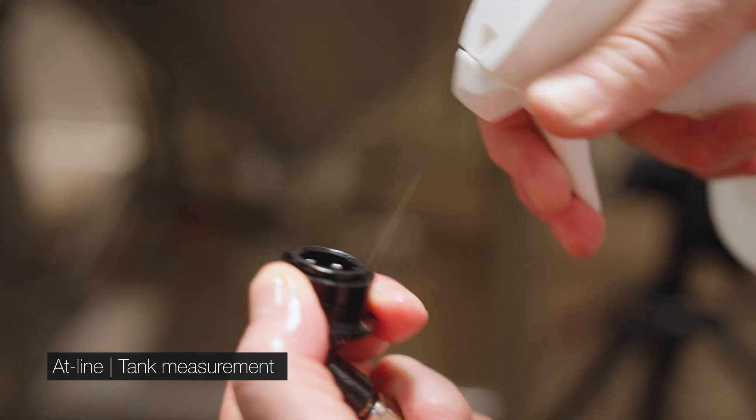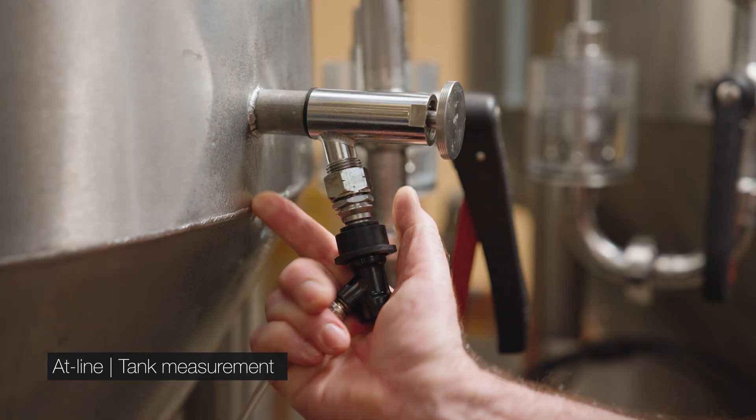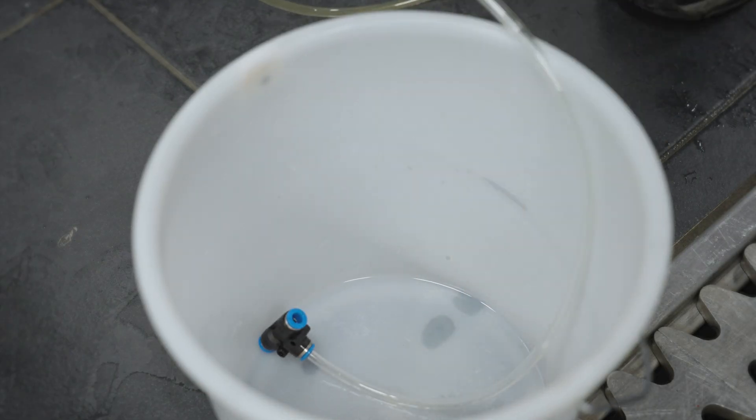Sanitize and connect the adapter or inlet hose securely to the sampling point. Put the outlet hose in the waste container.